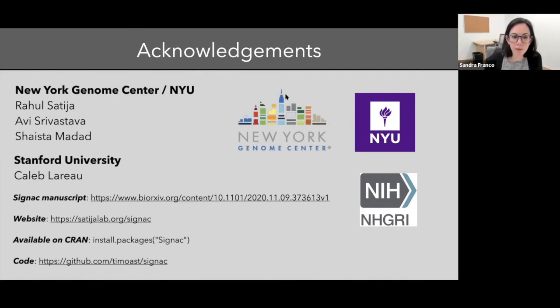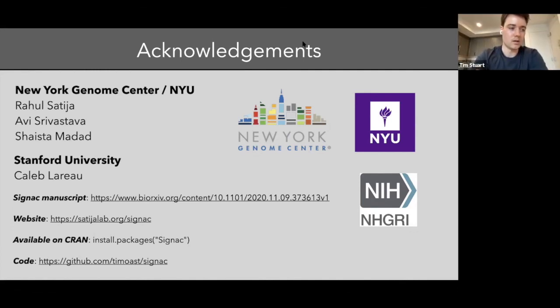Alex Rajewski is asking, is it better to do the dimensionality reduction on the MACS2 peaks or the Cell Ranger peaks? Yeah, so in terms of dimensionality reduction, kind of similar to the previous question, it doesn't tend to have a big impact on, say, clustering. But if you want to do differential accessibility and find peaks that are different between the different cell types, then it does have a big impact.